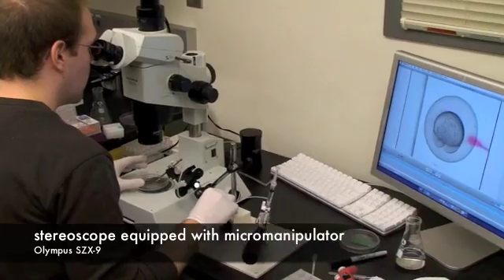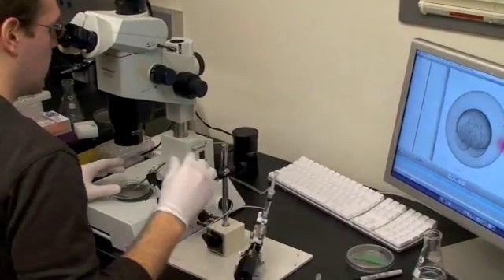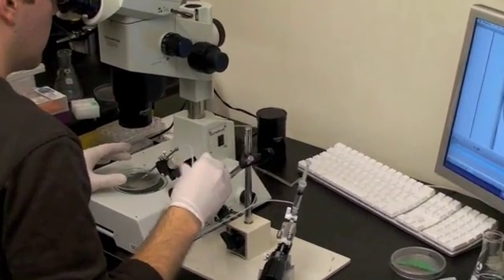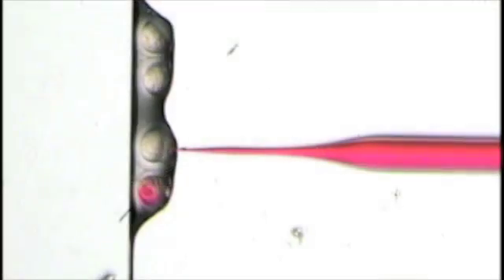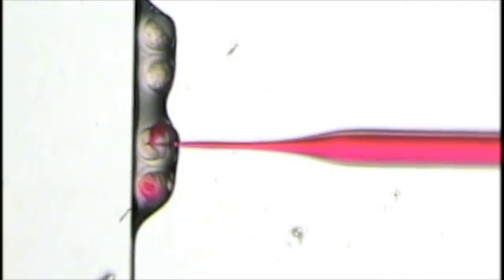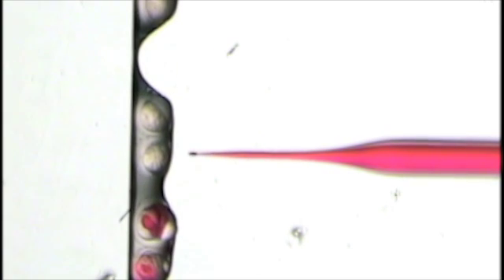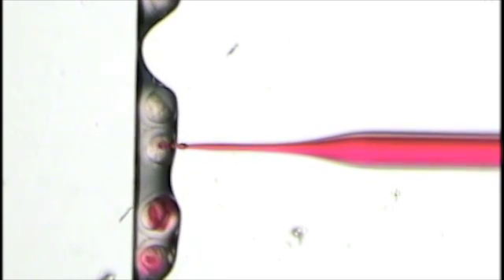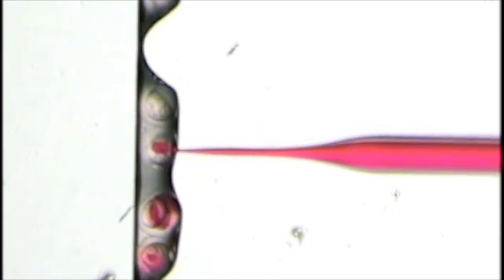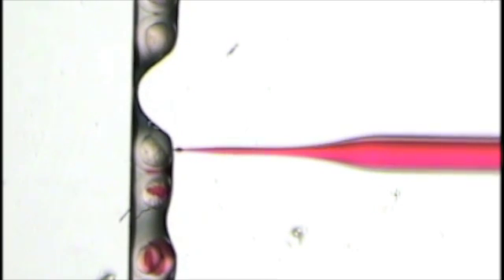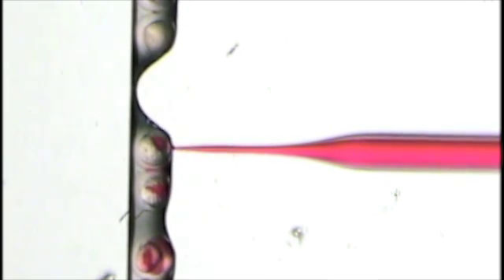The zebrafish embryos must be injected quickly as a rapid succession of cell divisions occur within an hour after fertilization. We must work quickly and with steady hands. The engineered DNA must be carefully injected through the protective chorion and into the relatively small cell that sits above a massive mound of yolk.